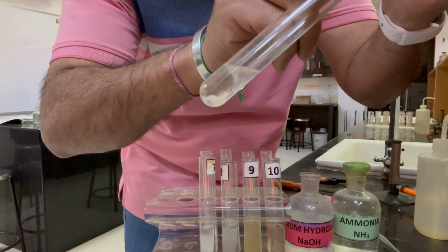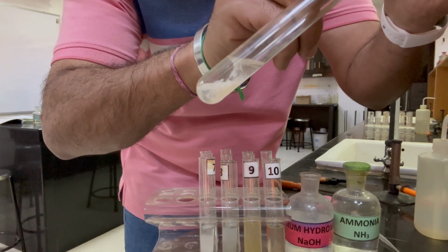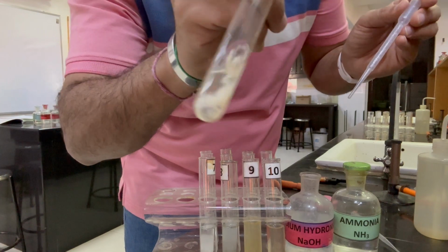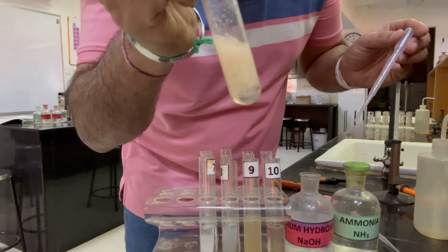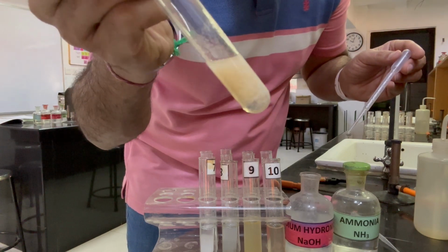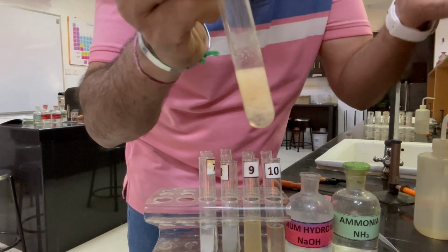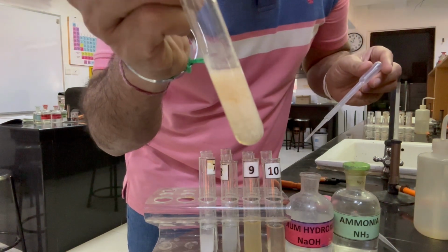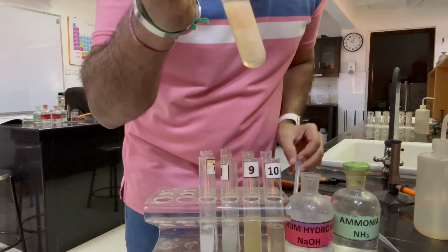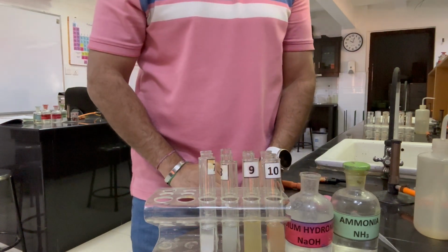So white precipitates start forming, and the precipitates are gradually turning brown. So the precipitates turned into a light brown color. And if we add an excess, those precipitates are insoluble. So let's record all these observations now.